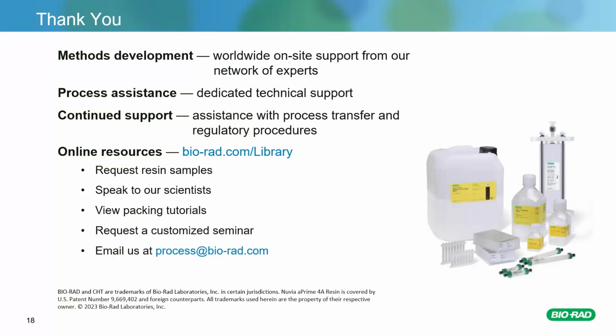Selecting appropriate factors for testing is more important than selection of the best DOE design at this stage. For example, if you test and control only pH and forget about conductivity, it might turn out that the results will be misleading because there is no visibility of how conductivity will influence the process.